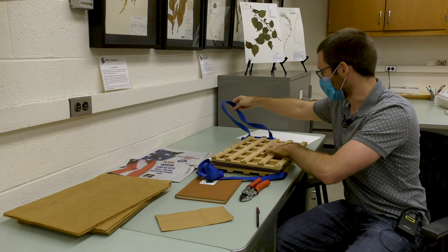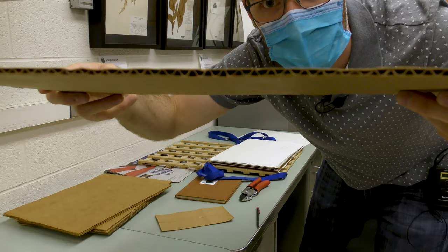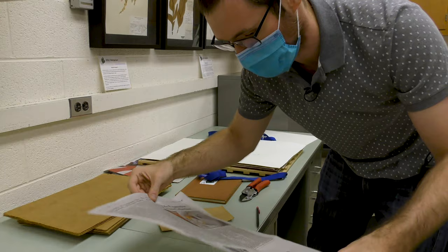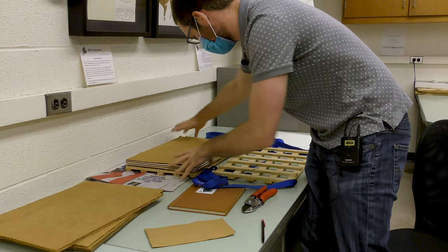It's kind of like a sandwich. What we've got here is corrugated cardboard — the perforations on the side let air flow through and dry the specimens out. Then there's blotter paper, which is just absorbent paper about the same size as a herbarium sheet. And in between the blotter paper and cardboard is just regular newspaper, which is absorbent and easy to find.